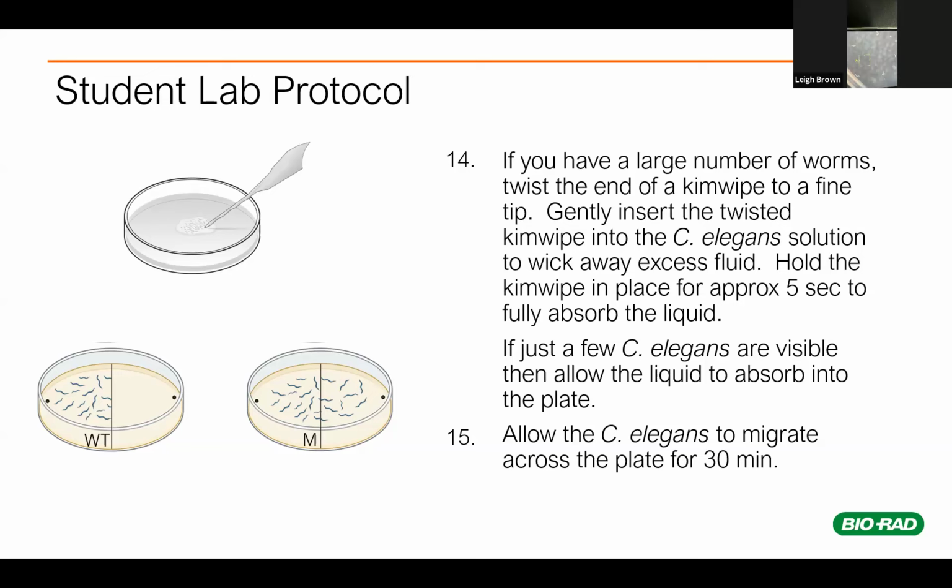So I think you somewhat addressed Kristen's question, Damon. How can we preserve the worms that we're not using? If so, how can we store them properly for long periods of time?